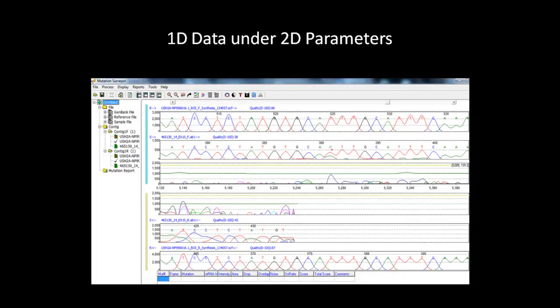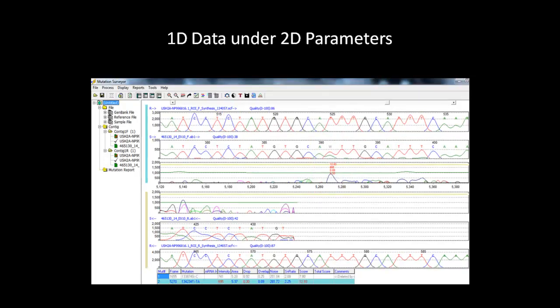This first example is a missed mutation call due to the parameters being too stringent. As you can observe in the mutation electropherogram and sample pane, the peak and red bar on top of the nucleotide position indicate that there is a possible mutation here that is not being called because it did not pass all the thresholds. However, we can switch to 1D settings by clicking the icon shown here. This icon will switch the analysis parameters from 1D settings to 2D settings or vice versa. The mutation is now called because the parameters are less stringent and it is able to pass all the thresholds.